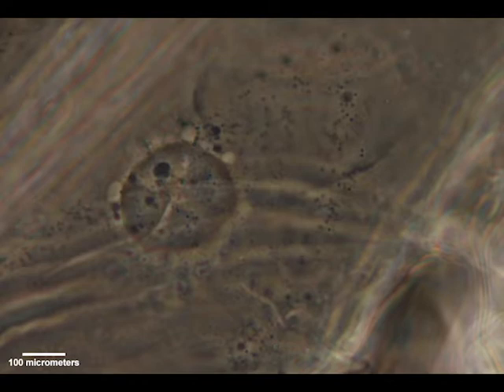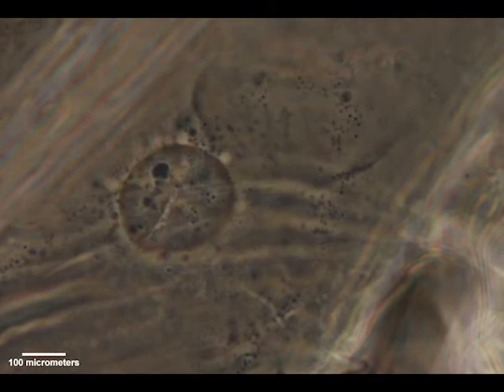The mechanism is not quite sure, but it was first theorized that cytoplasmic streaming was mediated by the physical contraction of the animal or cell wall or membrane in order to physically manipulate the movement of this fluid and the substances that it contains. But if we look at a closer picture of a cell wall, which might show up later in this video, I'll remember to point it out, cell walls, specifically in plant cells, are very, very rigid and don't allow for much movement. So we know that's probably not the correct mechanism.